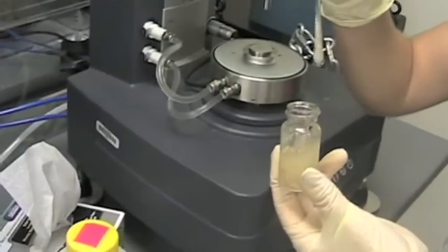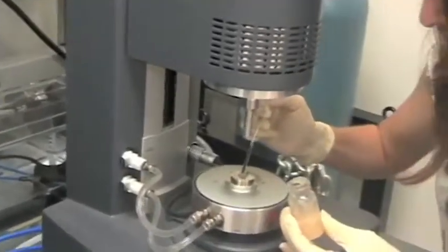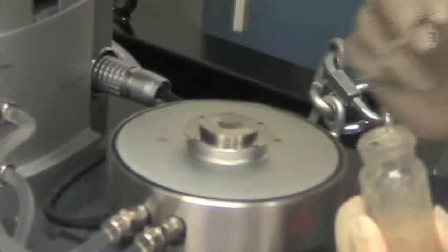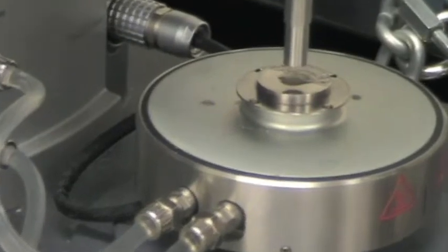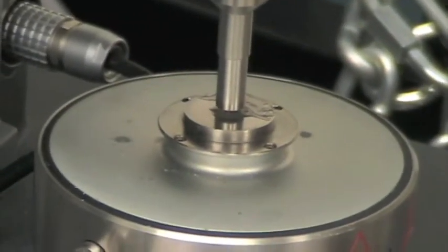You can see the alginate gel here is pretty thick, and so we'd like to measure the viscosity of this gel. So I'm placing it on the plate of our rheometer. I'm wiping away the excess gel so that we can bring the head of the rheometer down onto the gel. And when the machine is in contact with the gel, it can measure the viscosity, and then it will send that data to the computer like you see here.